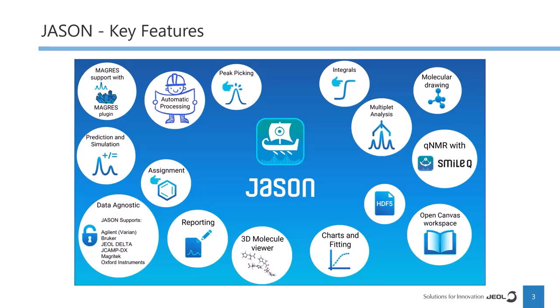More advanced features are handled via plugins. These are additional pieces of software that live within Jason that allow you to do more advanced analyses. I'll talk a little bit more about them a bit later on, but the focus of this presentation is going to be on SMILEQ, which is our qNMR plugin.